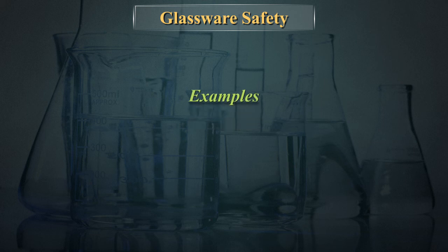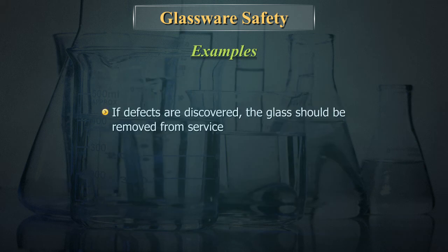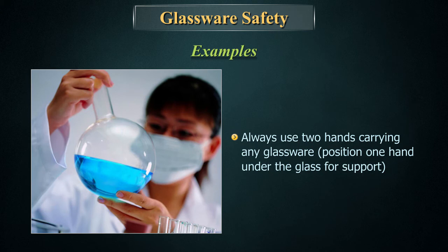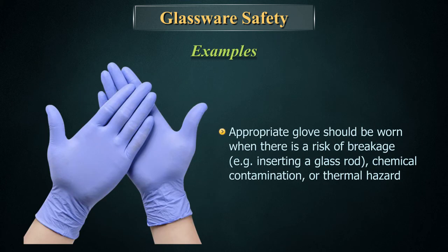Before working with glassware, always inspect it for flaws. If defects are discovered, the glass should be removed from service. Never carry a flask by its neck or a beaker by its side. Always use two hands when carrying any glassware.